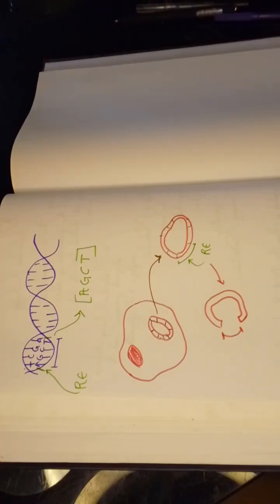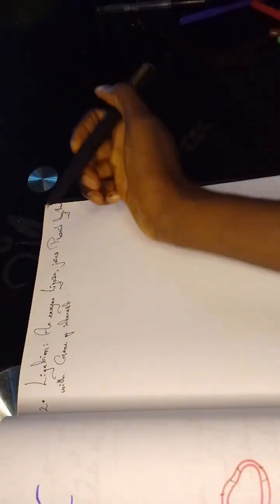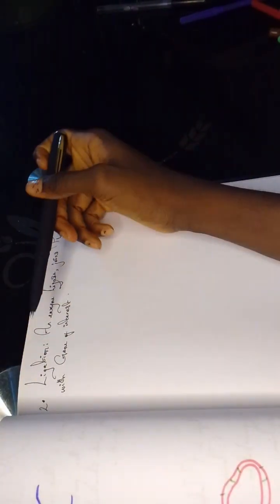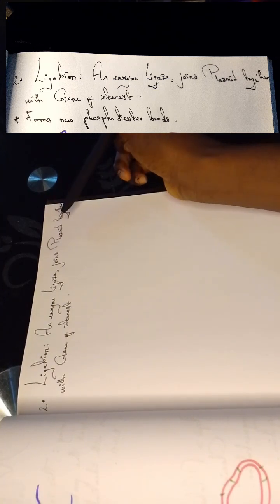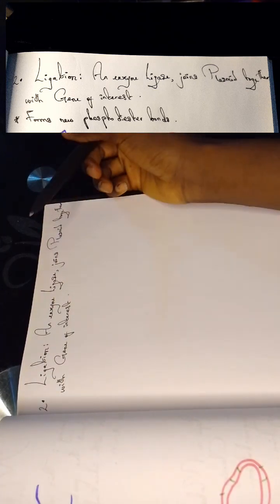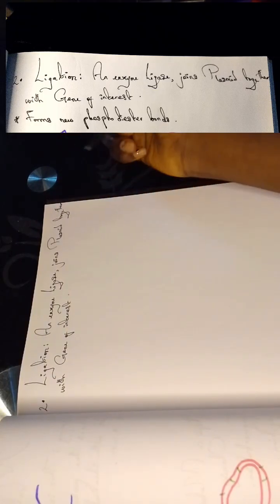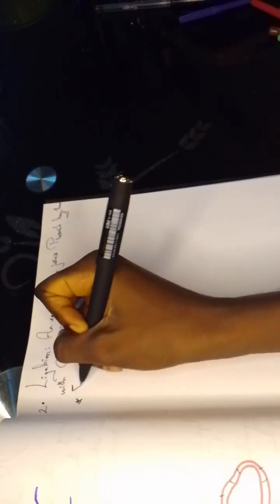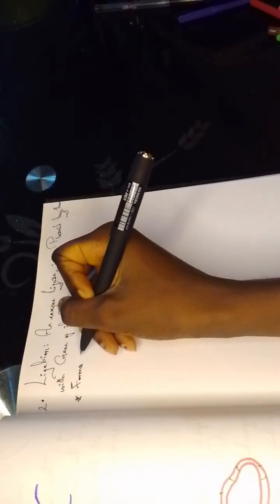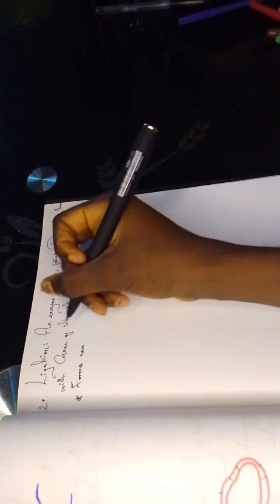So that's basically what happens in fragmentation, the first step of molecular cloning. The next step is ligation. In ligation, an enzyme, ligase, joins that plasmid together with the gene of interest. We've already cut them out in fragmentation. So in ligation, the enzyme ligase simply forms new phosphodiester bonds between the plasmid and gene of interest.